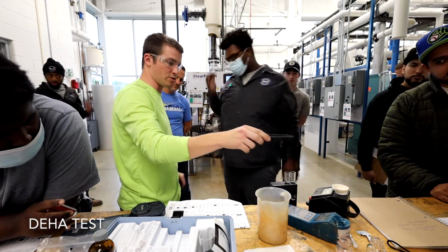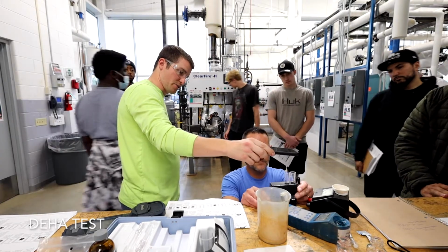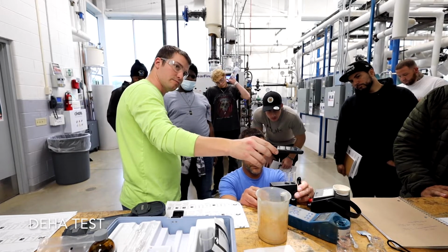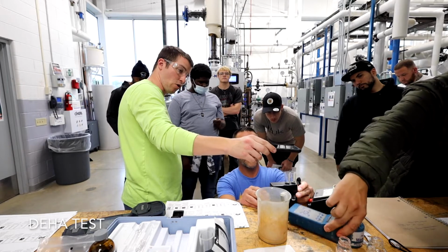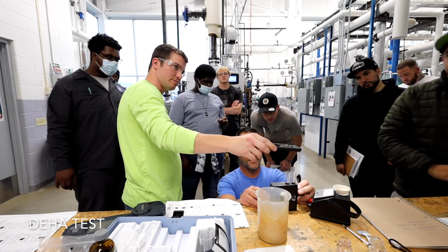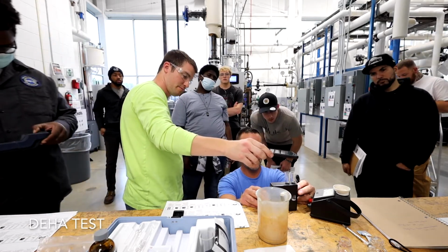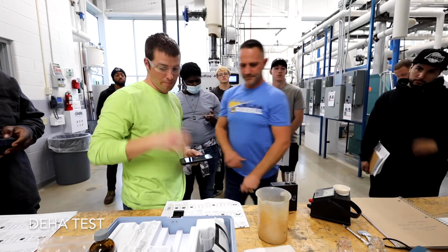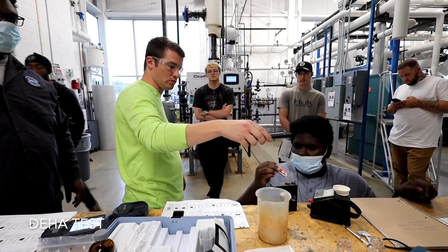Whoever wants to look can come look, by all means. You just spin it and try to match up the right and the left, just the colors on them. Yeah, exactly. It's kind of hard to tell without the lighting. Oh, you can touch it, go ahead. It's low, like 10 or something. Yeah, that's what I would say. Pretty close right in there. That's what I was thinking. If someone else wants to look, you're just trying to match them up. So it's going to be low.